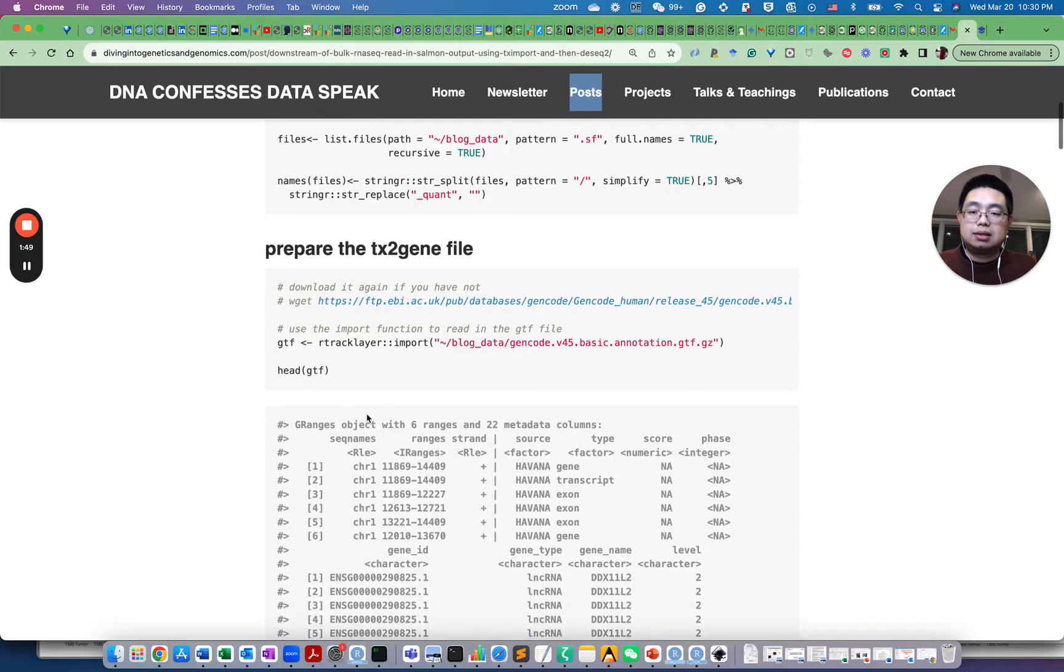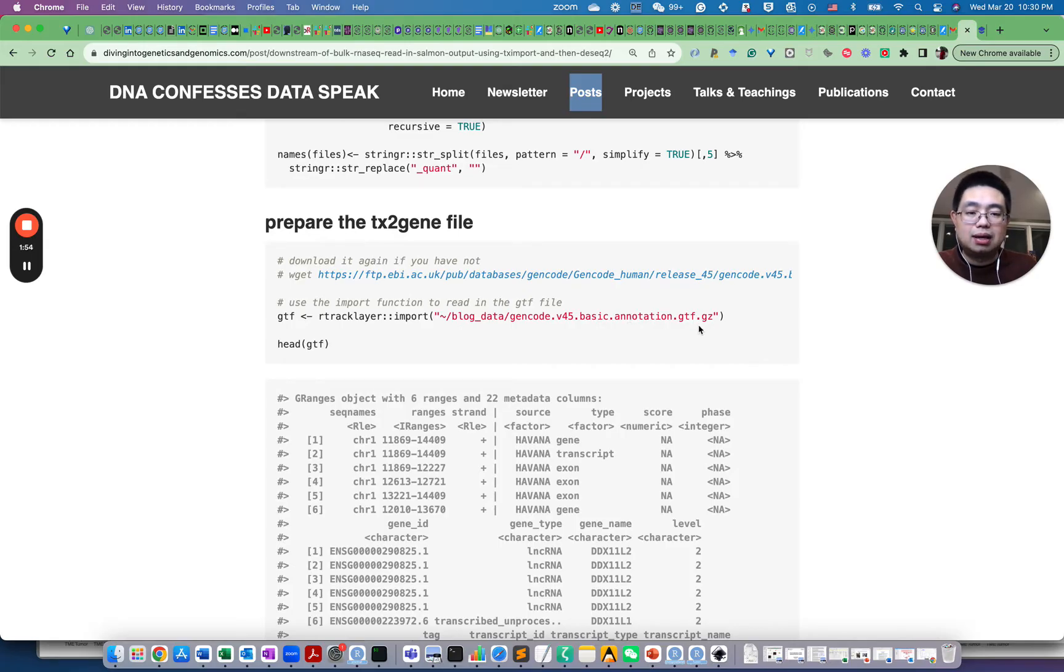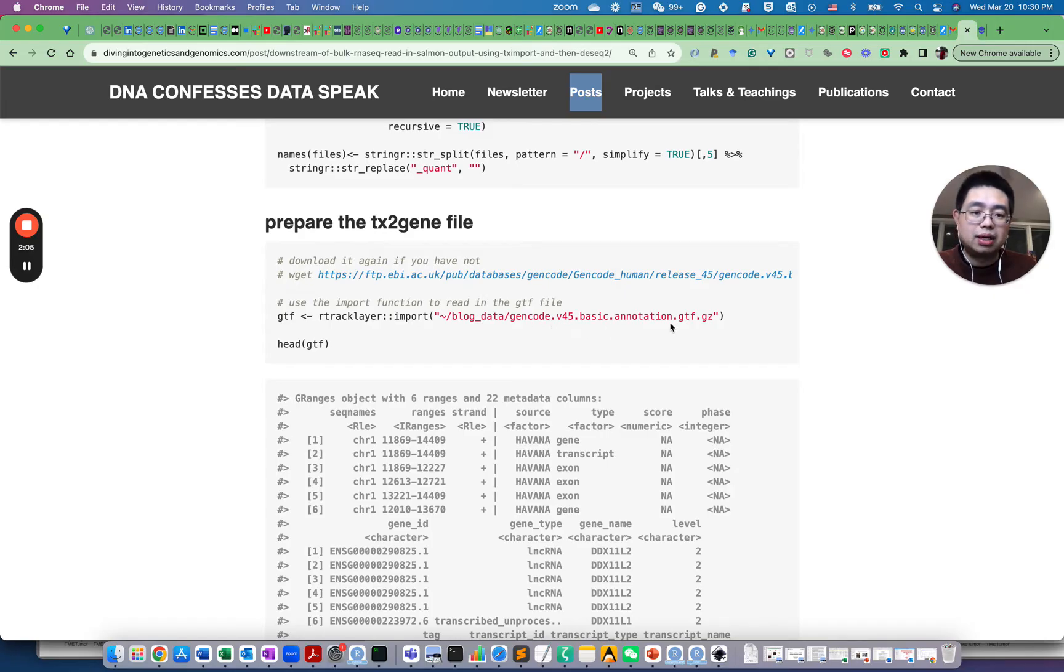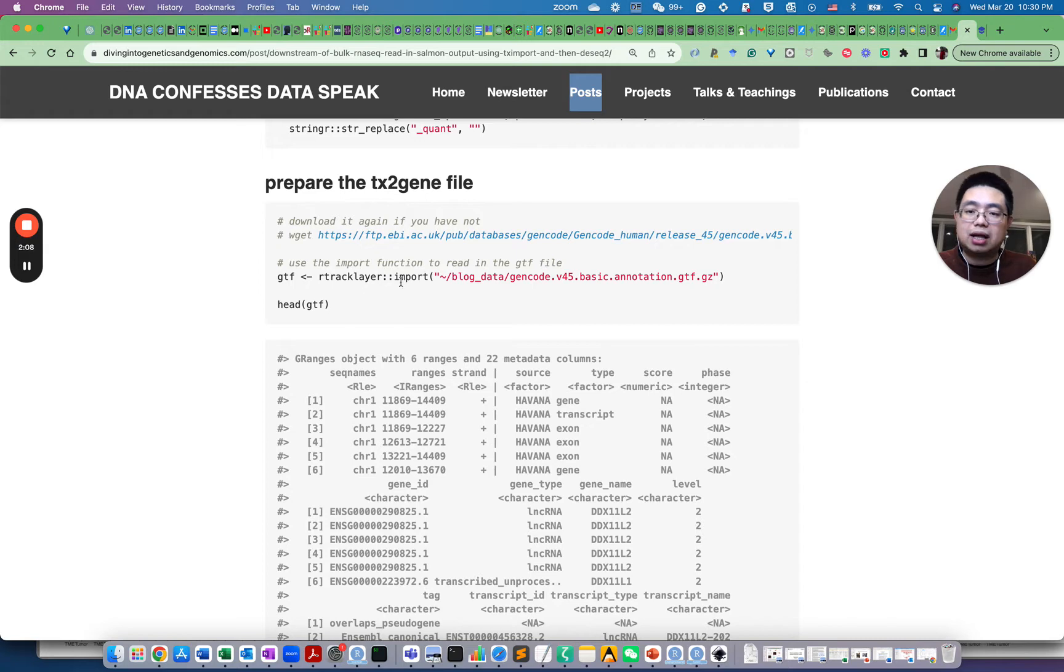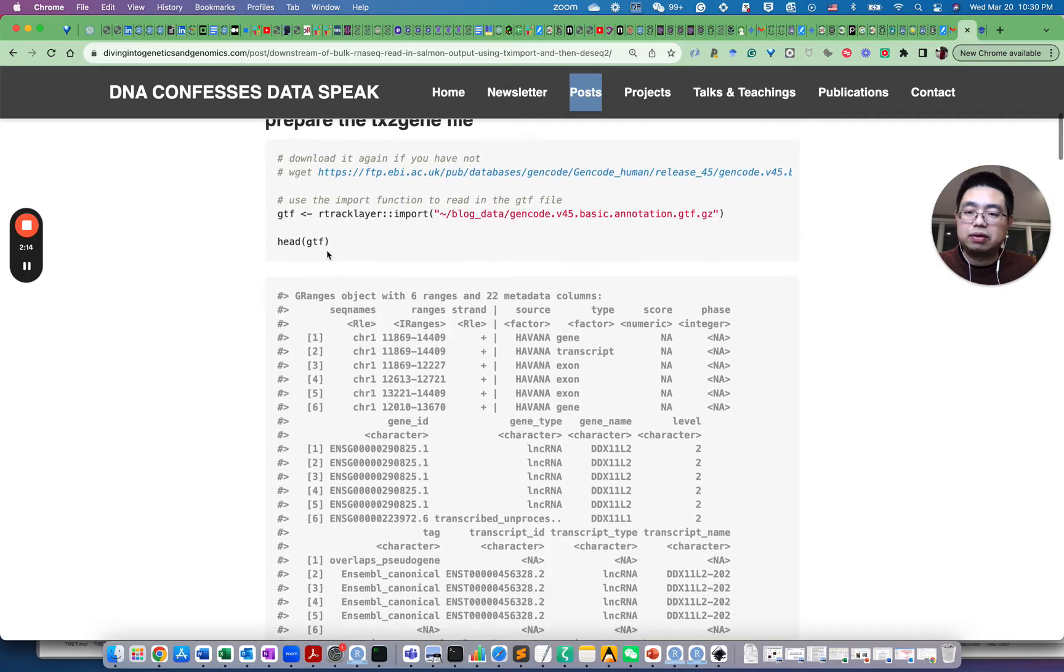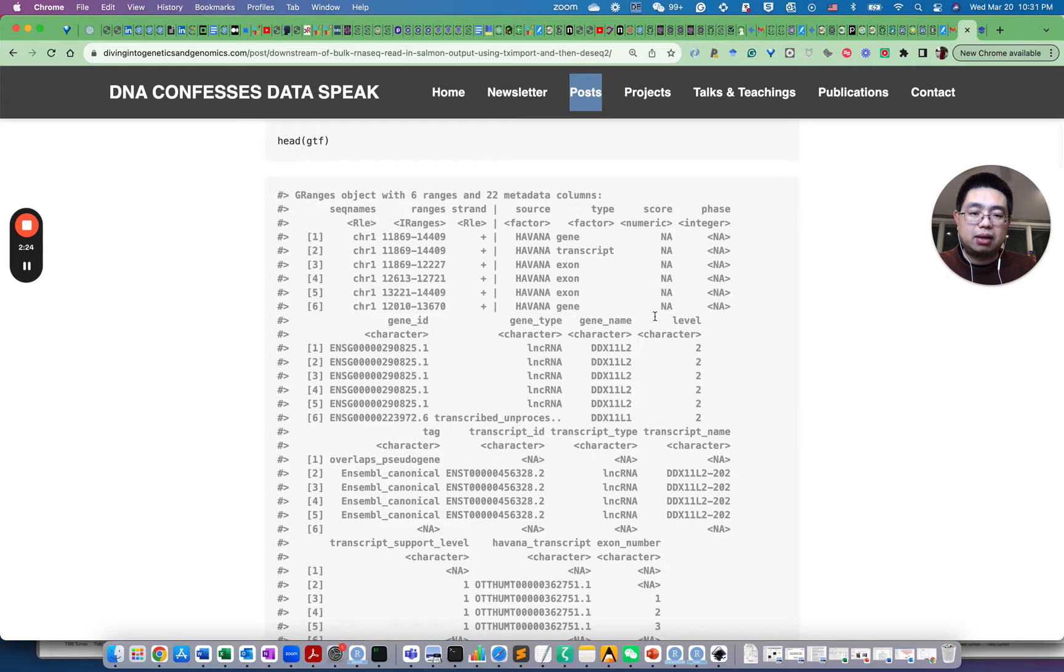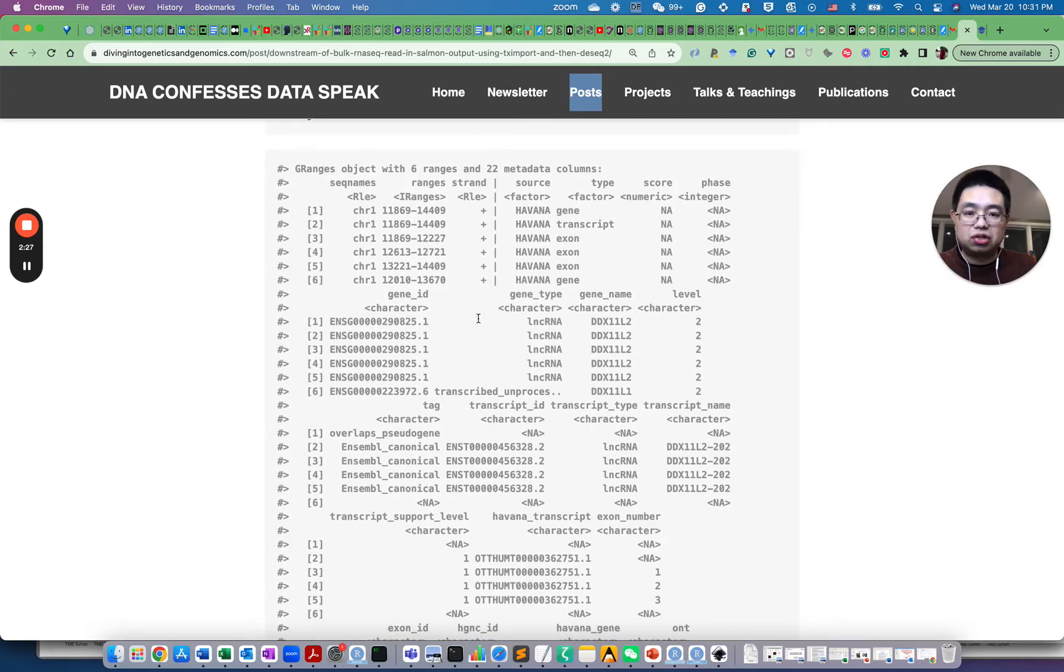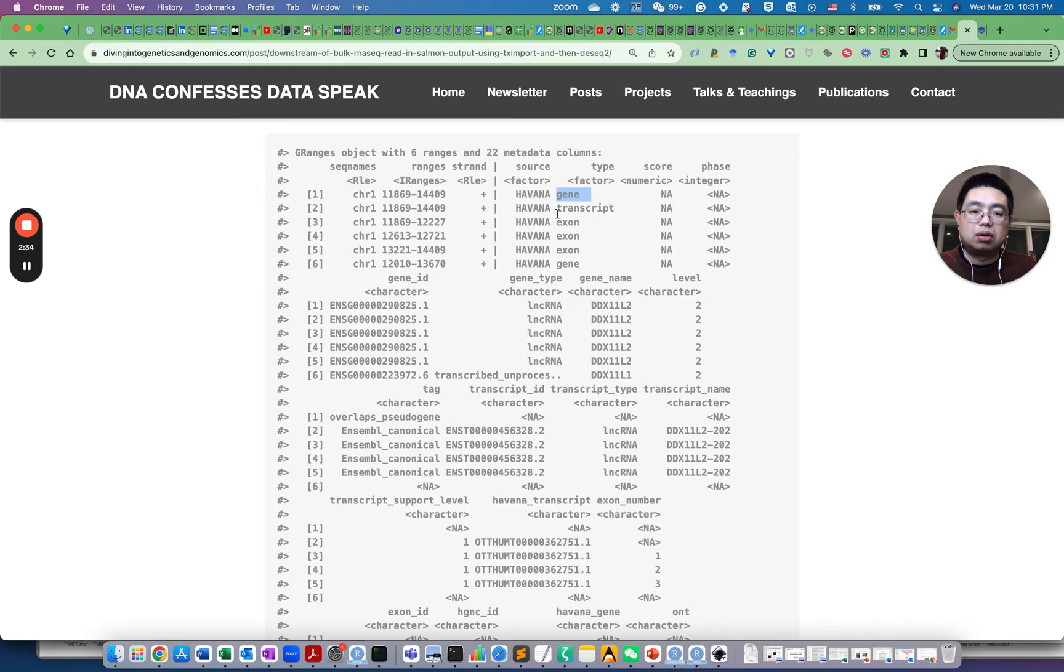To do that, we import the GTF file that we used from the same reference file. In this case, the GENCODE GTF file. You can use the rtracklayer import function to read in the GTF file. If you look at the first six rows of the GTF file, this is a genomic ranges object. It has the chromosome name, start and end, and some other metadata information for each feature here.